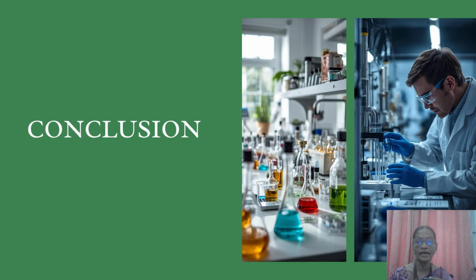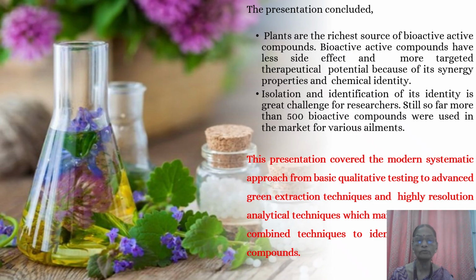Coming to the conclusion of our slide. Plants are the richest source of bioactive compounds. Bioactive compounds have fewer side effects and more targeted therapeutic potential because of their synergy properties and chemical identity. Isolation and identification of their identity is a great challenge for researchers. Still, so far more than 500 bioactive compounds are used in the market for various ailments. This presentation covered the modern systematic approach from basic qualitative testing to advanced green extraction like supercritical, pressurized and microwave extraction techniques, and high resolution analytical techniques, including combined techniques, to identify the specific compounds of interest.